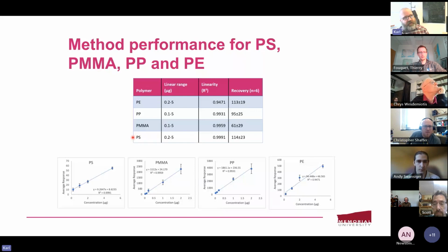Right. So one thing I didn't talk about that actually might have been useful for an ASMS group, apologies, are the specific target ions that we're monitoring. Most of the pyrolysis GCMS work that I've seen focuses on detecting by selected ion chromatogram relatively low mass pyrolysis products.